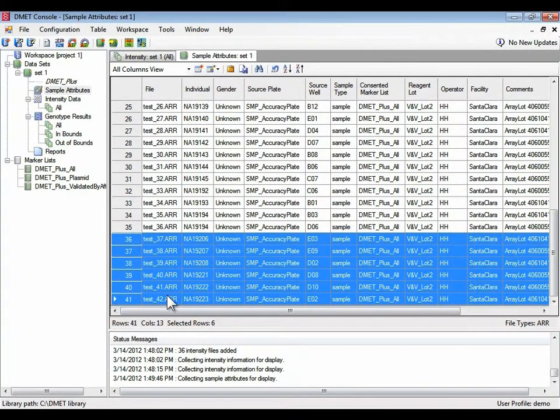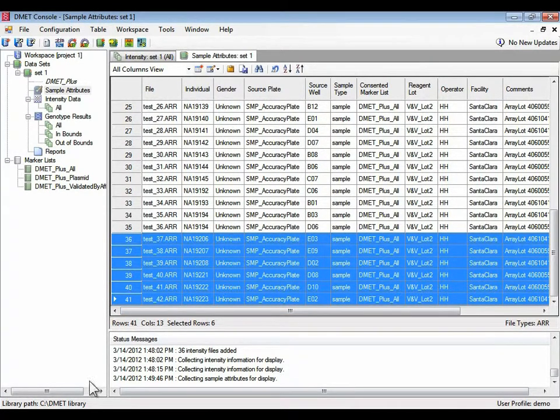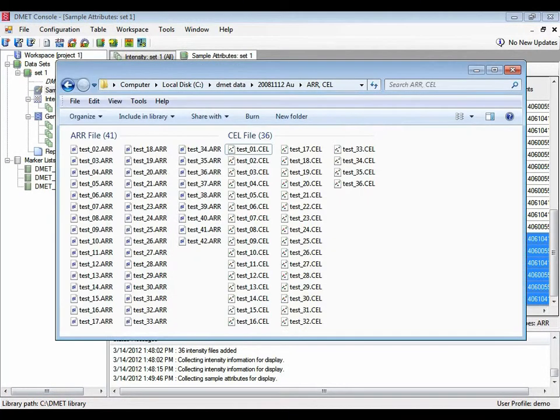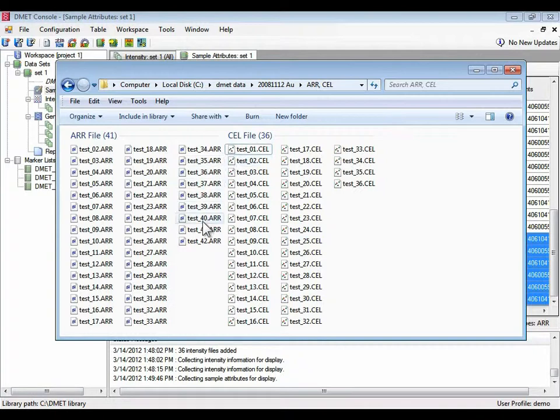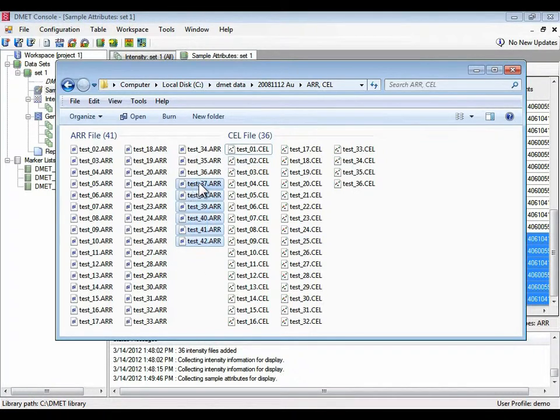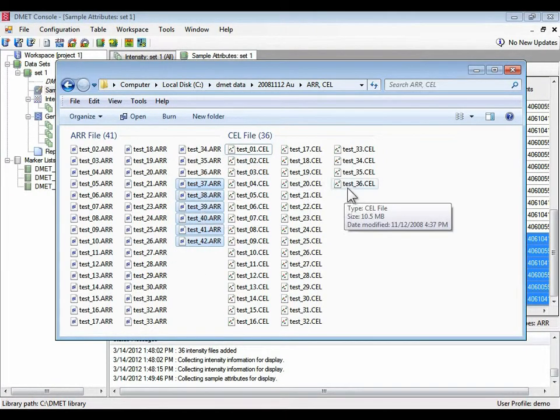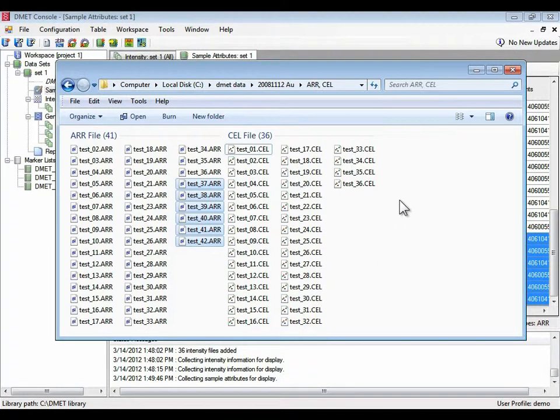So these last ARRs, 37 to 42, don't have that. So that's, again, going back to my comment, 37 to 42 don't have associated cell files.